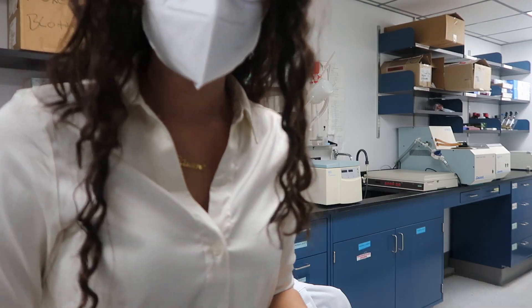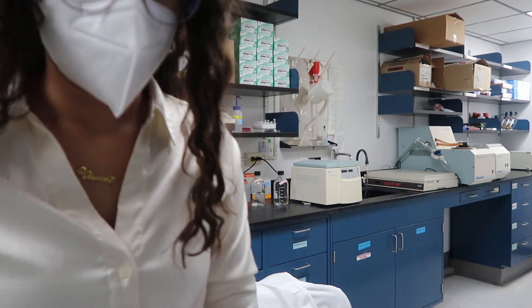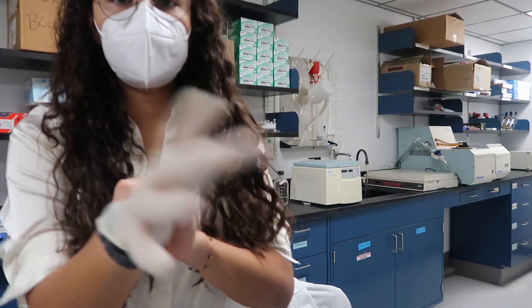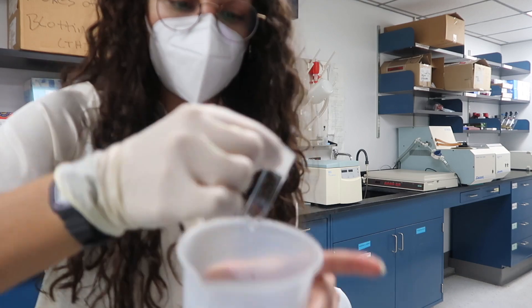Are you guys ready for washes? This takes about an hour, so let's run it people. Got our slides, I'm going to get our little dishes. I'm going to put on gloves because we're working with antibodies and that's sketchy. Oh, my gloves matched my shirt! Just dumping off primary so that I can wash.